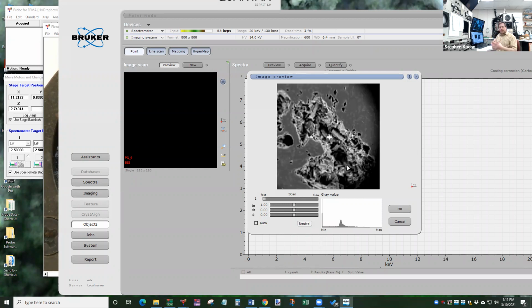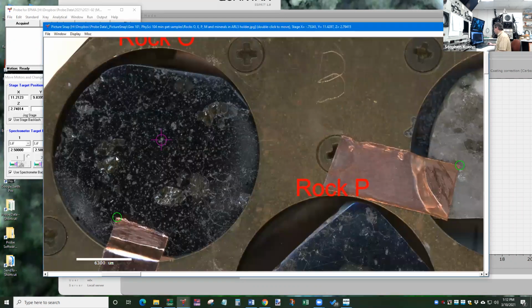It would have been a bubble of gas in magma or lava, and now it's just a hole. So apparently there are some of those in this rock. We call those vesicles, so that would probably be worth noting down. But it also means that I probably need to pick a different place, because I was trying to get a crystal, not a hole. Let's try another place.